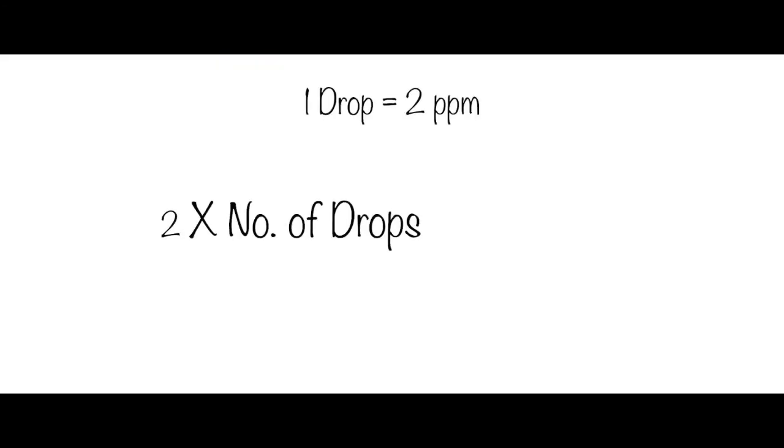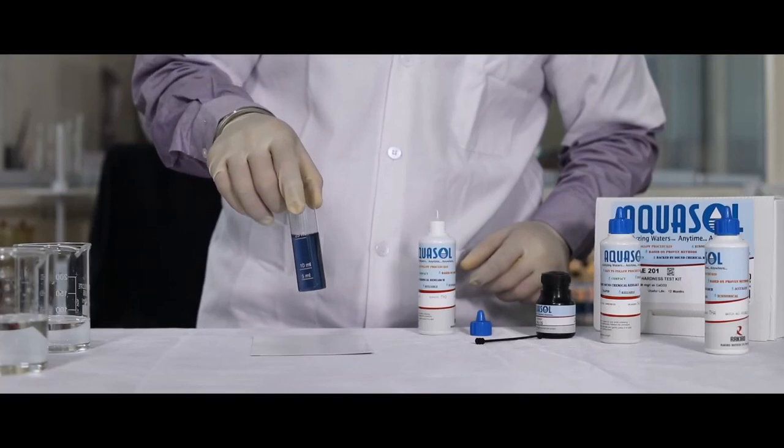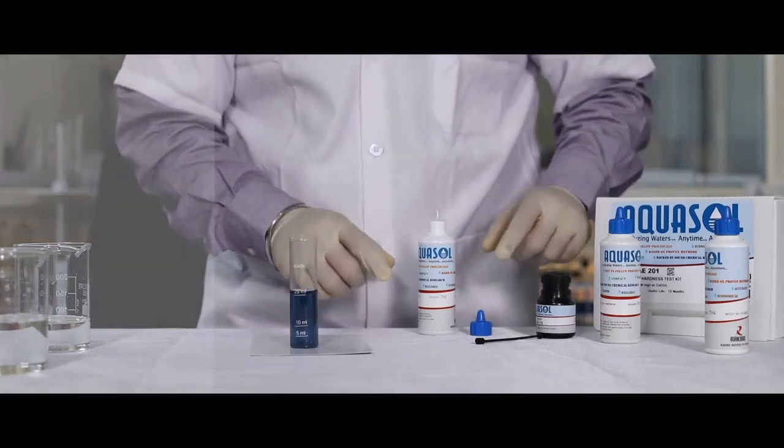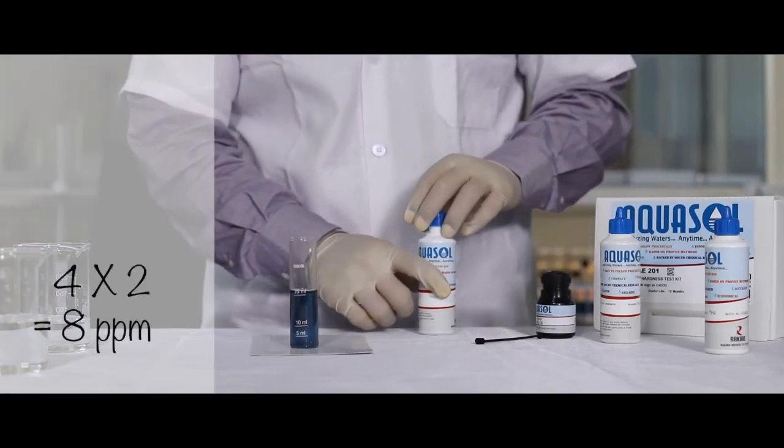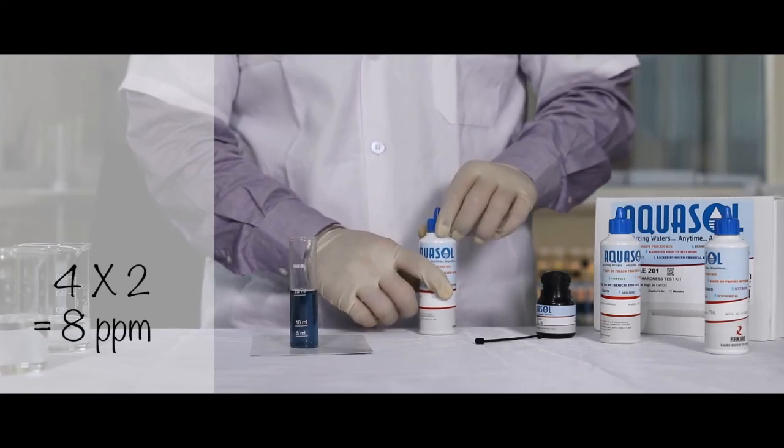Number of drops of TH3 reagent multiplied by 2 is the hardness of the sample. For example, 4 drops of TH3 reagent was added, that is 4 multiplied by 2, which is 8 ppm.